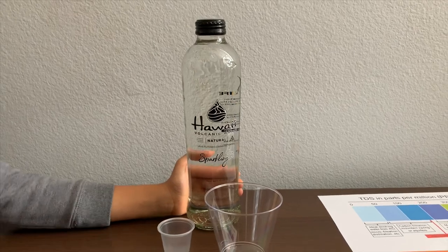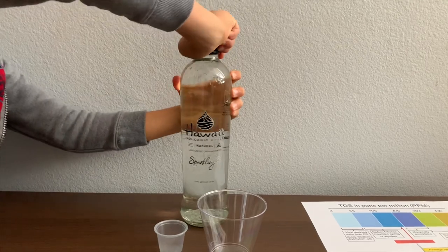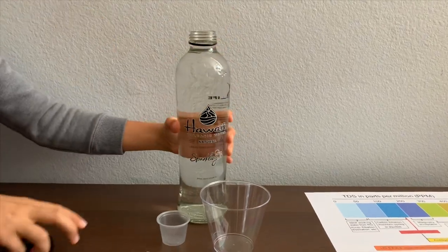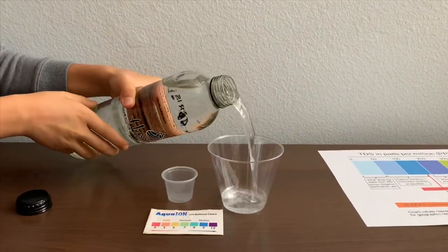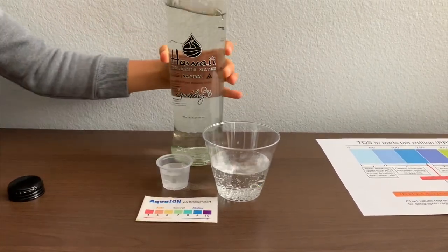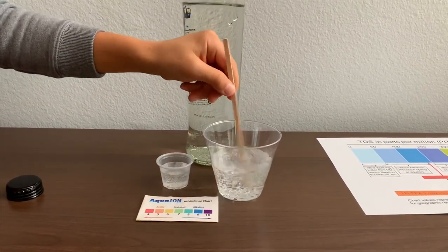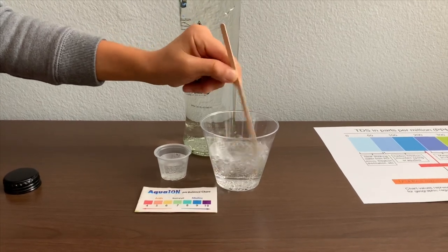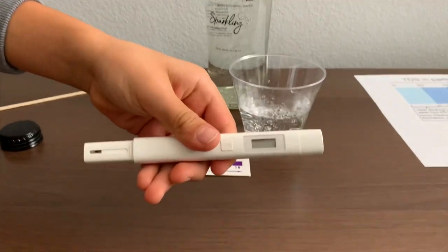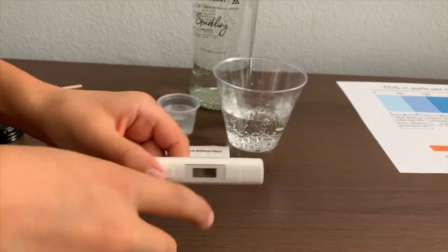Let's test the pH and TDS levels. Let's pour some water in. First, let's test the TDS level — let's stir it a little for a better result. If you want to buy this TDS tester, check the link down below. Turn on the TDS tester, make sure it says zero, and put it in.